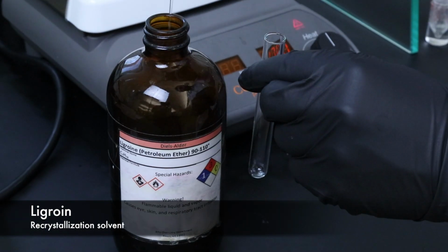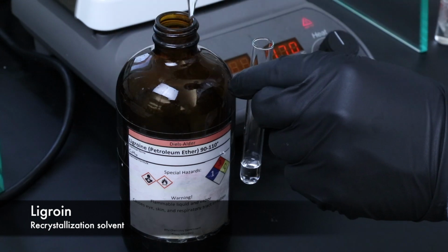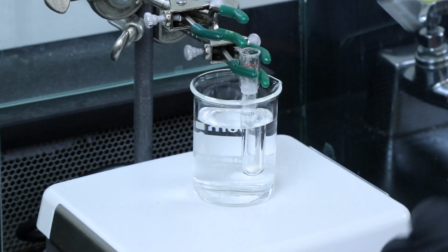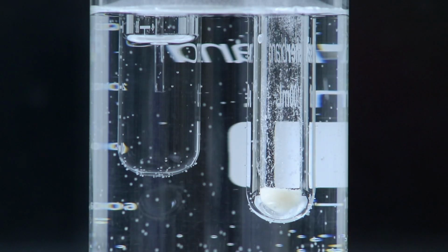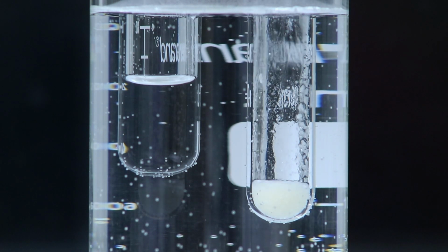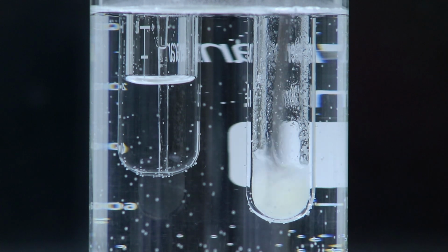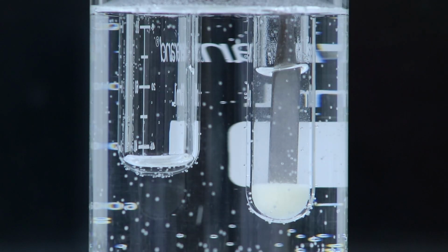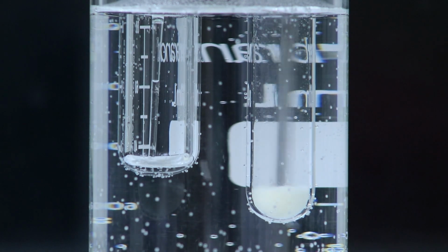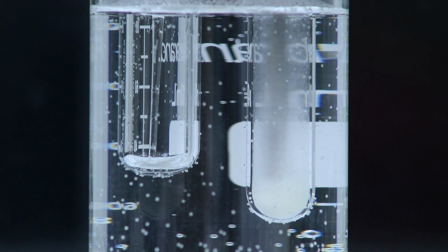I'll be using ligroin again, this time as the recrystallization solvent, so I'll go ahead and add that to the hot water bath as well. And now I'll start trying to dissolve the crude product by adding hot ligroin and stirring it with a spatula. But after adding quite a bit of ligroin, you can tell that the solid is still not dissolved, meaning that there's probably quite a bit of diacid contamination.